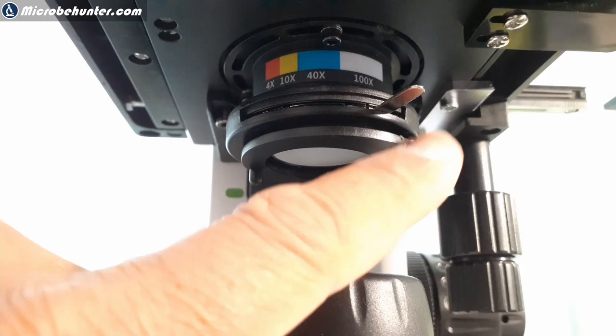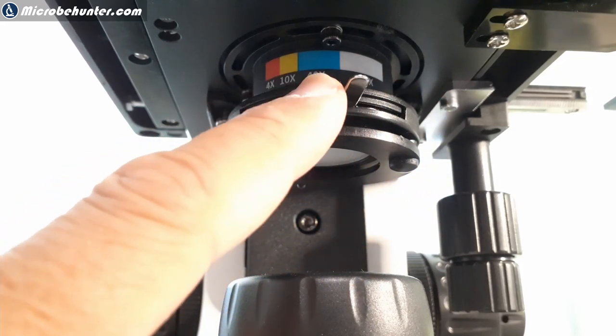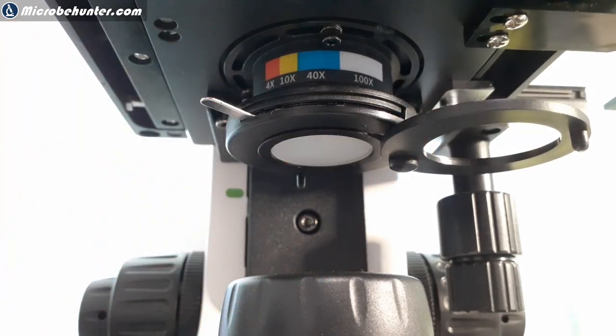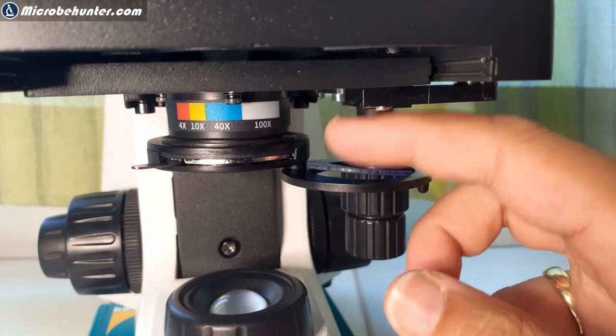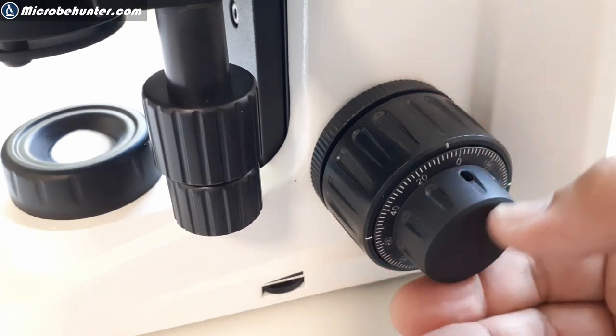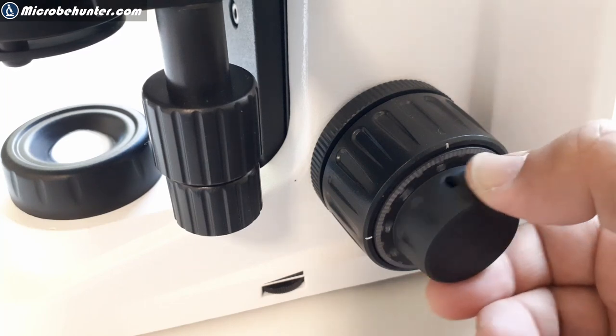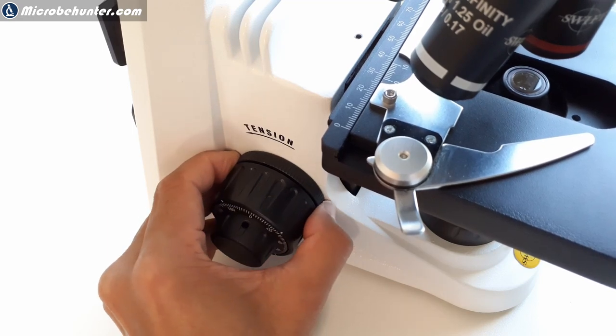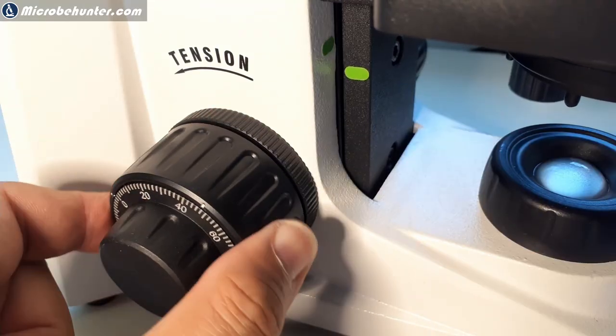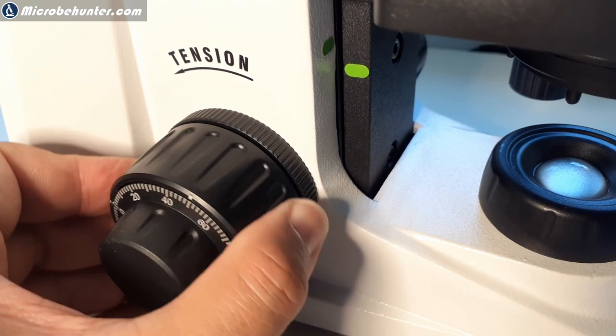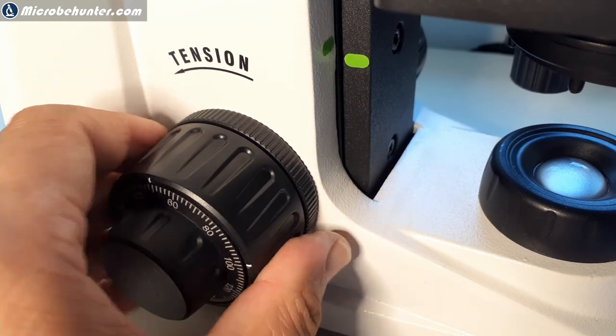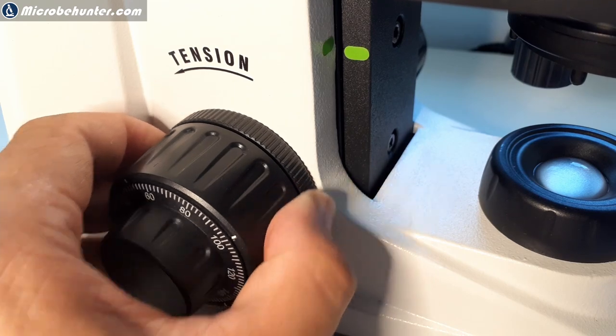And we now have a look at the bottom of the stage. And this is the condenser diaphragm. It's quite interesting because it's color coded. Normally, they write down the numerical aperture, but I think the color coding is more easily understandable. You can put in the blue filter, and this is the coarse and fine focus knob. And when you turn the fine focus knob, then you see that the coarse focus does not turn. And that's actually a good sign. They're decoupled. There is also a tension ring that can be used to adjust the resistance of the focus knob. And I'm tightening it and it makes it a little bit more difficult to turn. So this tension ring allows you to adjust a comfortable turning force.